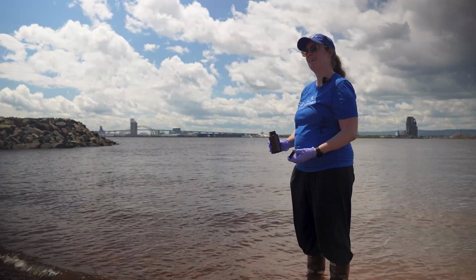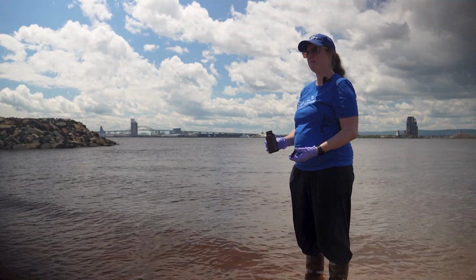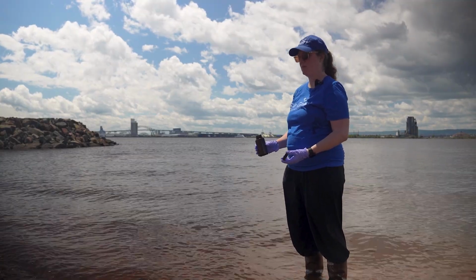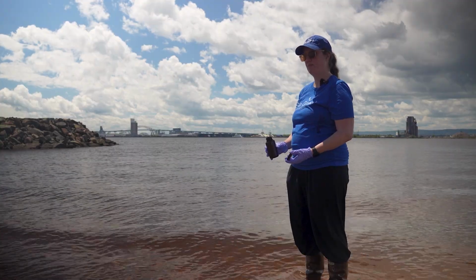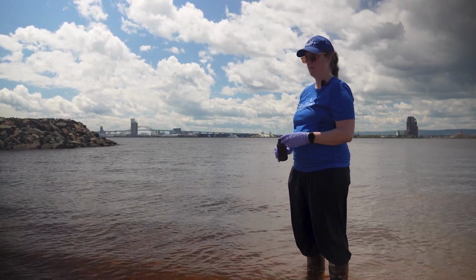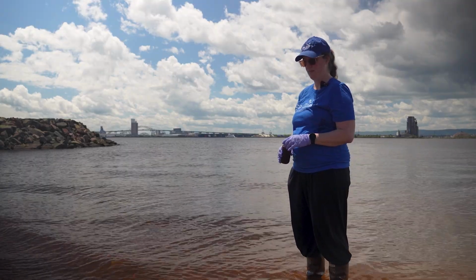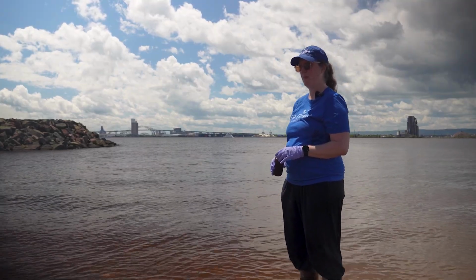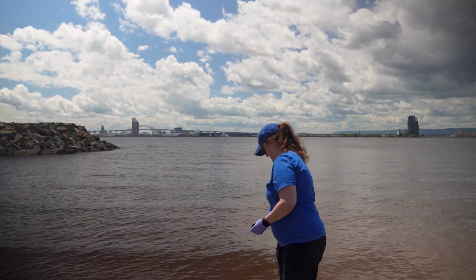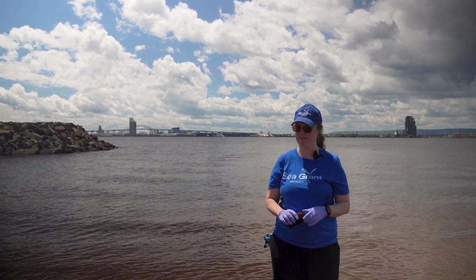So when you triple rinse the bottle, you'll want to do this away from where you're going to be collecting your actual sample, because we don't want to disturb that sampling site. So if you're on a boat, you can rinse off the port side and collect the sample off the starboard side. And so after you triple rinse it, we should be ready to collect a surface skim sample.